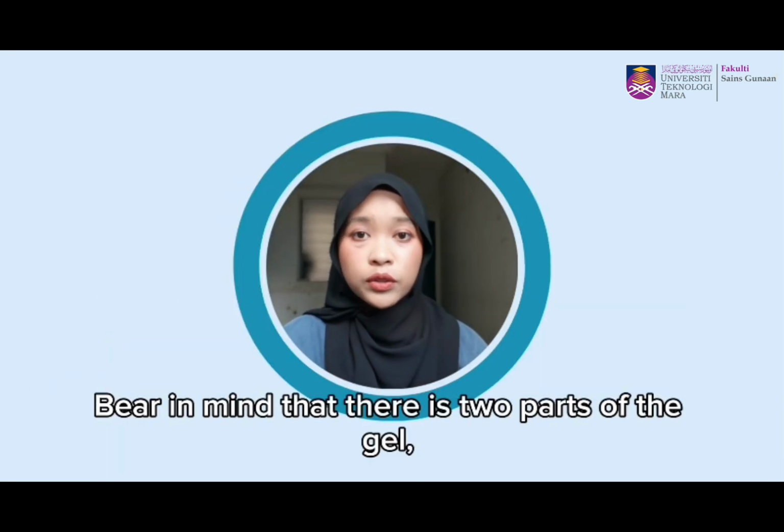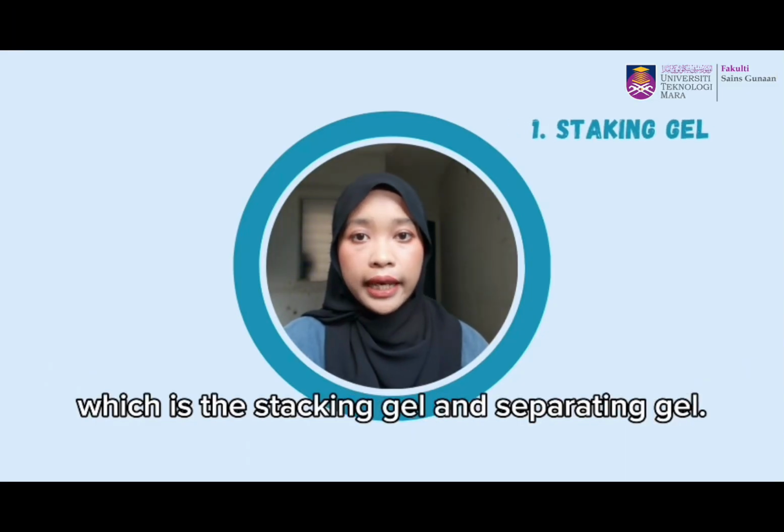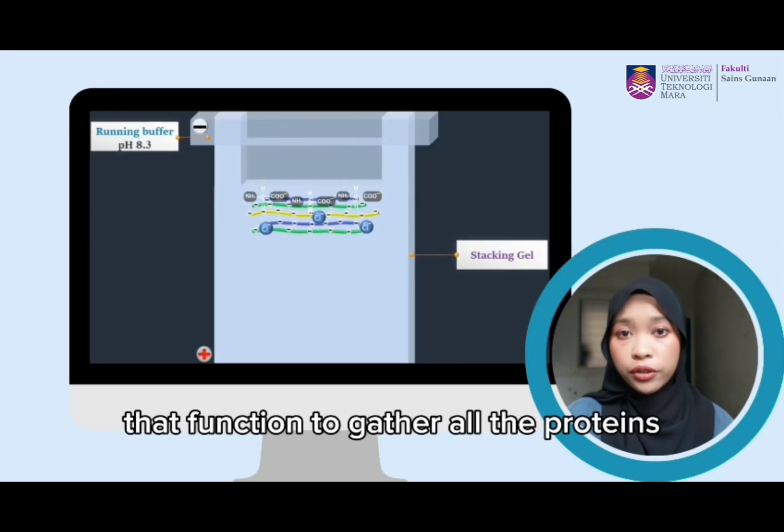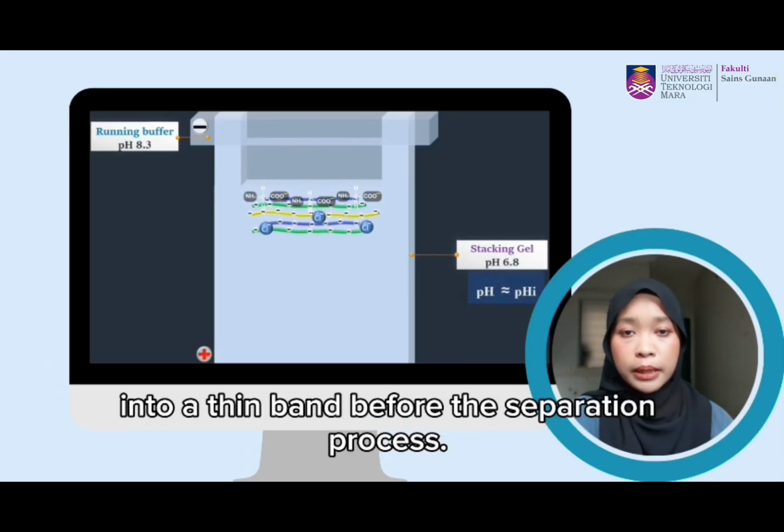Bear in mind that there are two parts of the gel, which are the stacking gel and the separating gel. The stacking gel is the upper part of the gel and has larger pores that function to gather all the proteins into a thin band before the separation process.